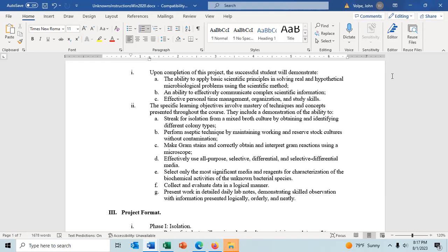Okay. And then that will be day 1. And then a week from today, I'll send you the results. You can put in, and here are the results for the gelatin hydrolysis test. You don't need to put that in your unknown notes page now, because I know that everyone's going to have those 3 tests.